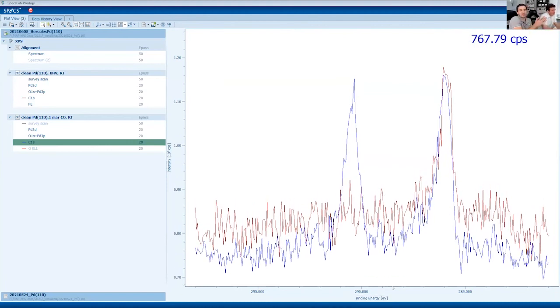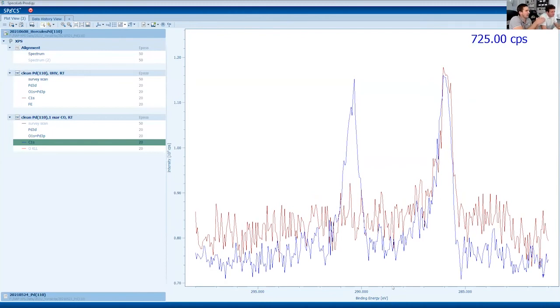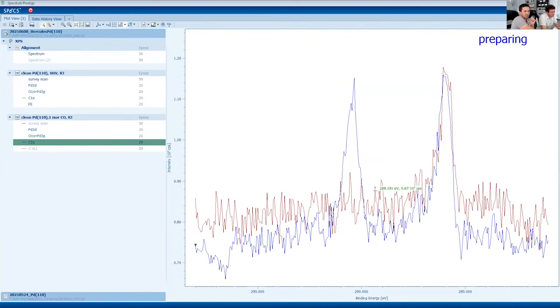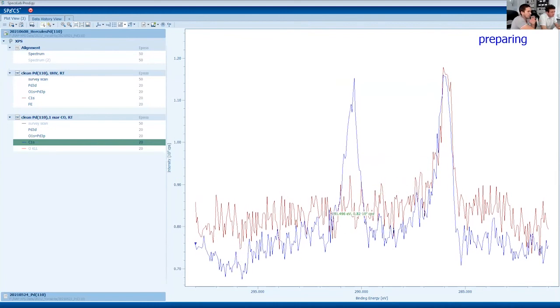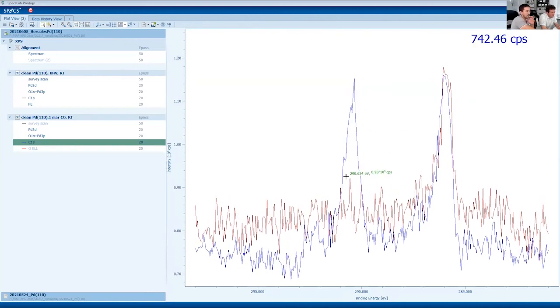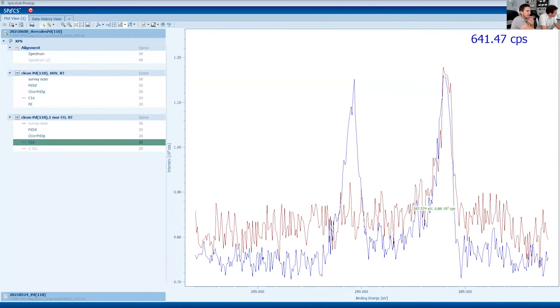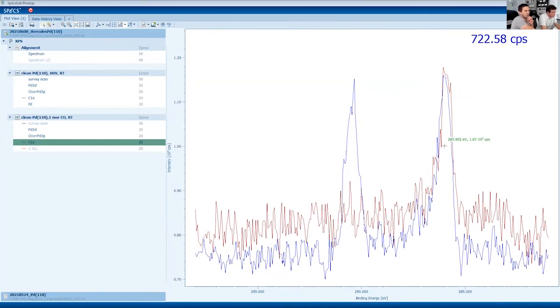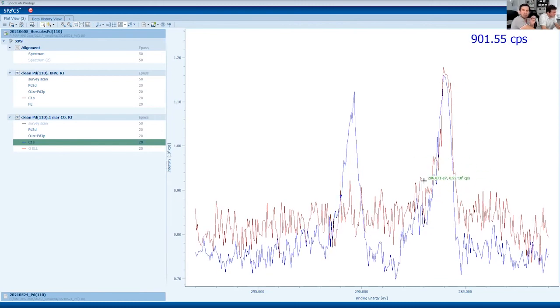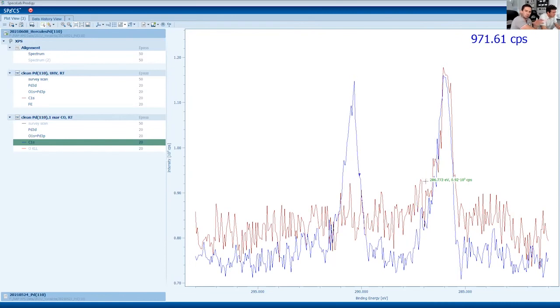However, I think if we try to add some oxygen and heat the sample, at some point we will see the gas phase from CO2. It would be somewhere here, a bit lower in energy. The gas phase of CO will decrease, and CO2 will increase. Also, at some point you would remove all this chemisorbed CO, and another small peak might appear, which would correspond to some adsorbed CO2. Such chemistry you can see.